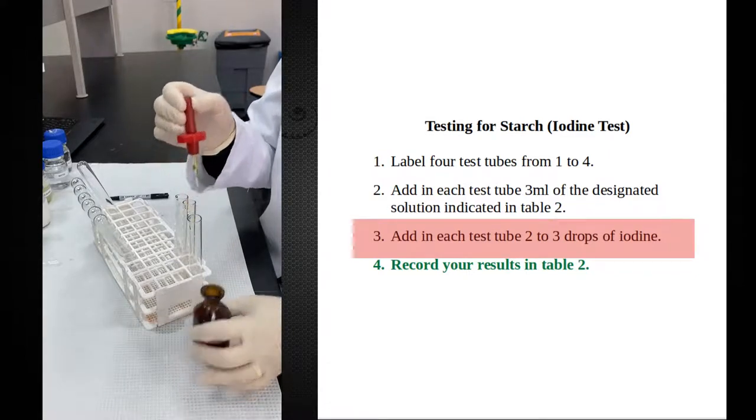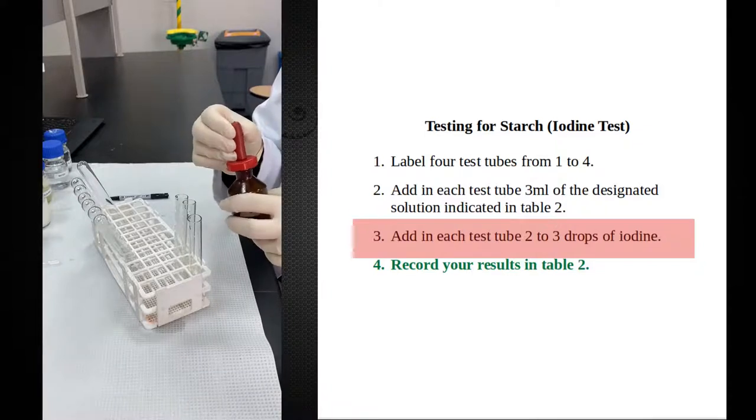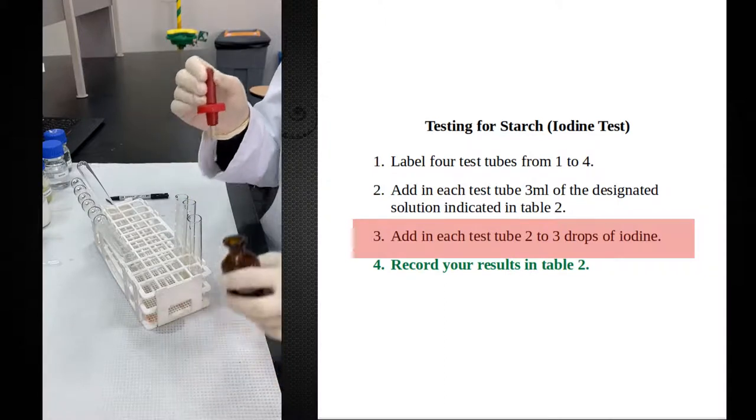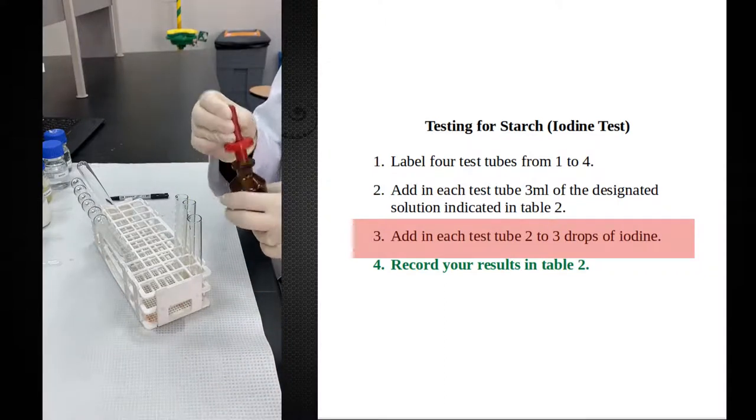One, two, three, four, five. Sometimes iodine solution is too light. We will need to add more. And sometimes it's good enough.